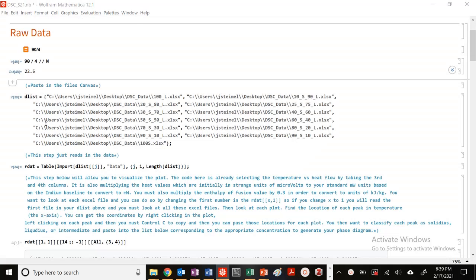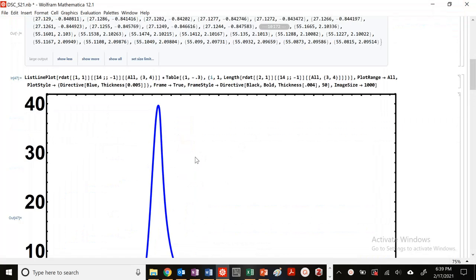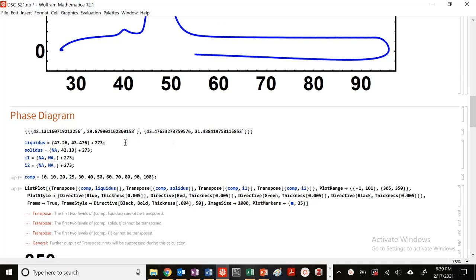So my notebook is thinking, now it's not responding. That's why we always save. Okay, so let's get back to this plot again, so we can multiply that value, and we've seen that before. So the other thing that I want to do is to start to build up a phase diagram.